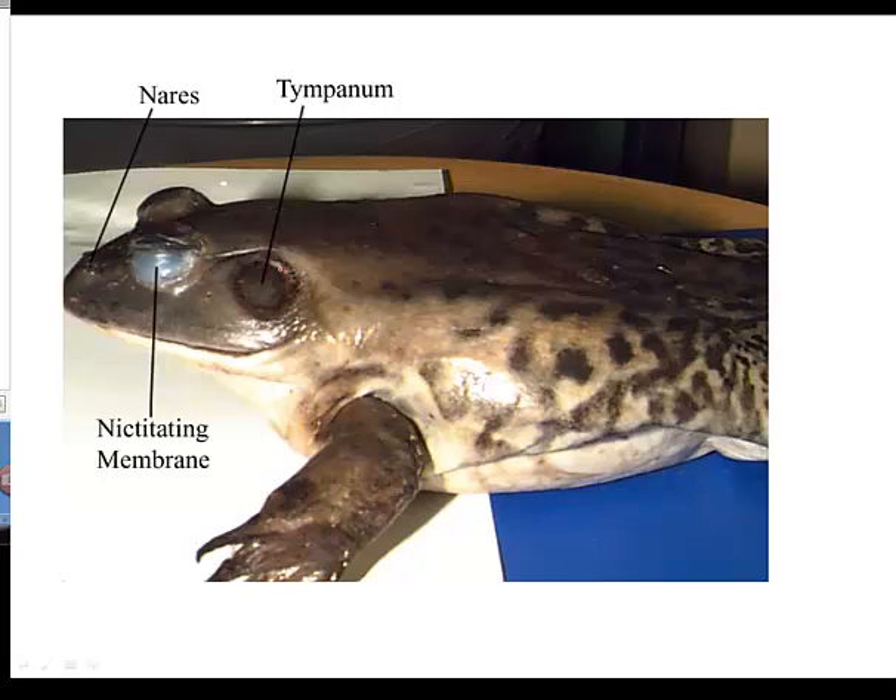Behind the nictitating membrane is going to be the tympanum. The tympanum is the eardrum, essentially — it's what picks up sound vibrations, allowing the frog to hear.